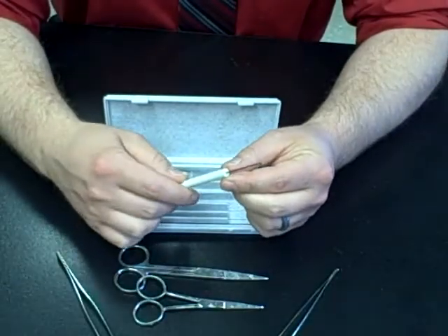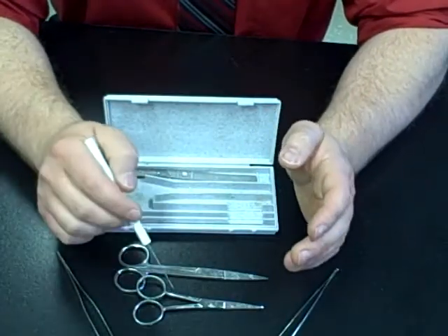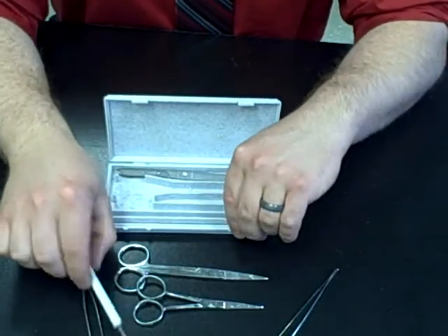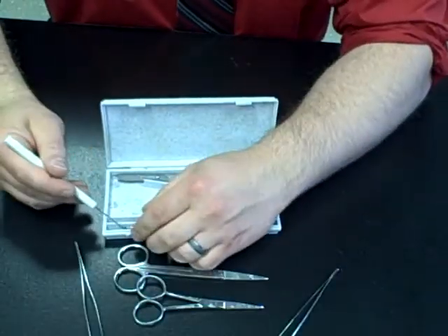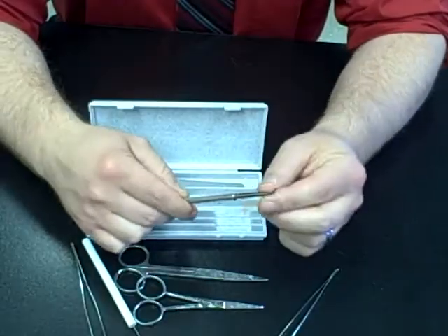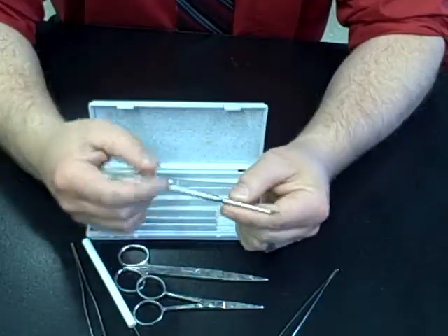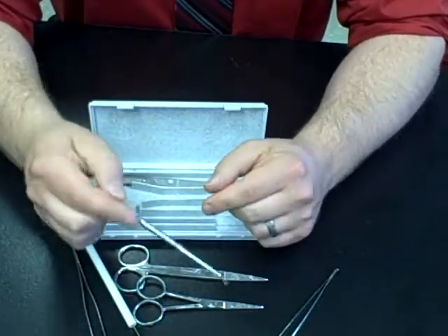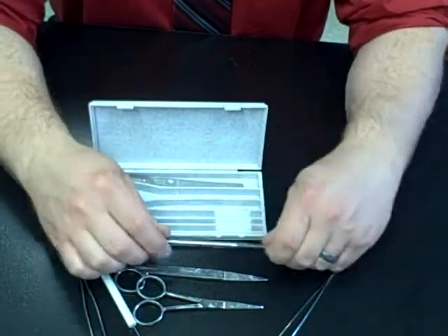The probe isn't helpful for too many things other than pointing to parts. If you need precision when pointing to a certain area, you can certainly use this. The curved probe is also good for pointing at things, and sometimes helpful for getting other items out of the kit. The curved or blunt probe is helpful because it will not damage tissue. There are times when you have to scrape tissue away carefully, or point to something without damaging your specimen — this one is always a safe item to use.